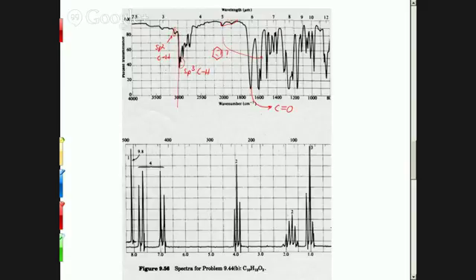The one thing that I want you to always look for in your NMRs when you're trying to analyze this are peaks between 7 and 8, or let's say 6.5 to 8. Let's say 6 and 8. There's really only one thing that's in that region. Does anybody have a correlation chart open? I can show you in the book here.